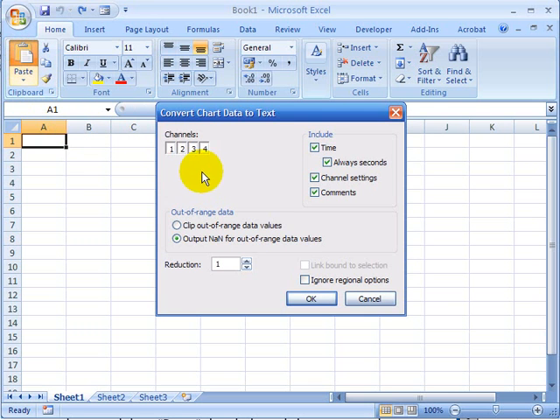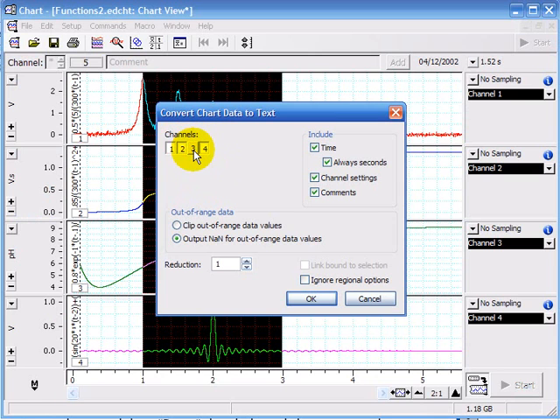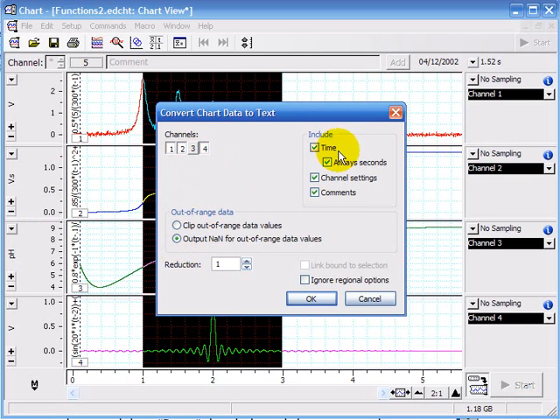You get this box which asks you which channels you want to copy over. For example, if I don't want to copy three, I'm going to unclick it. It lets you include the time, comments, etc.